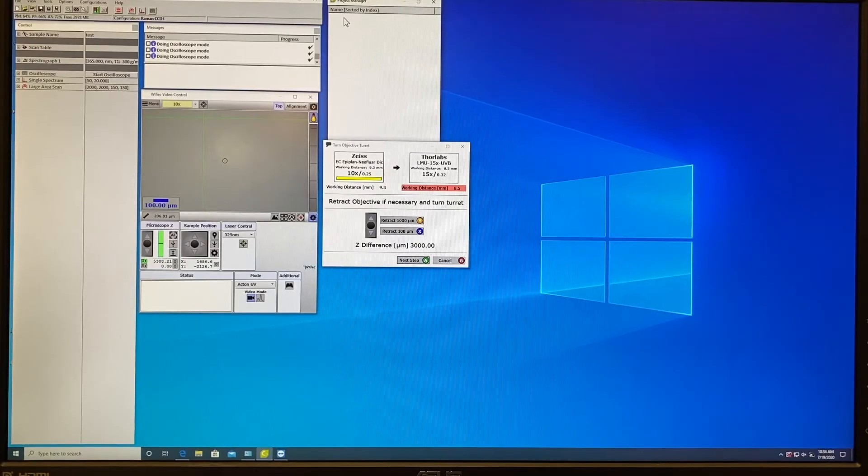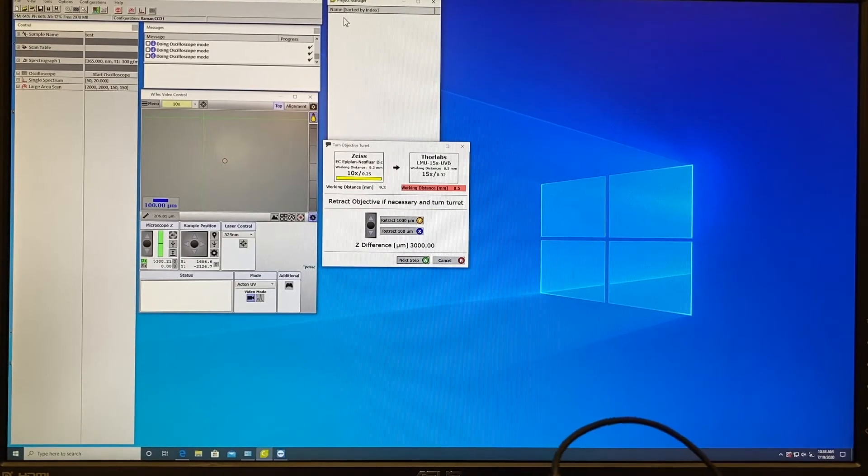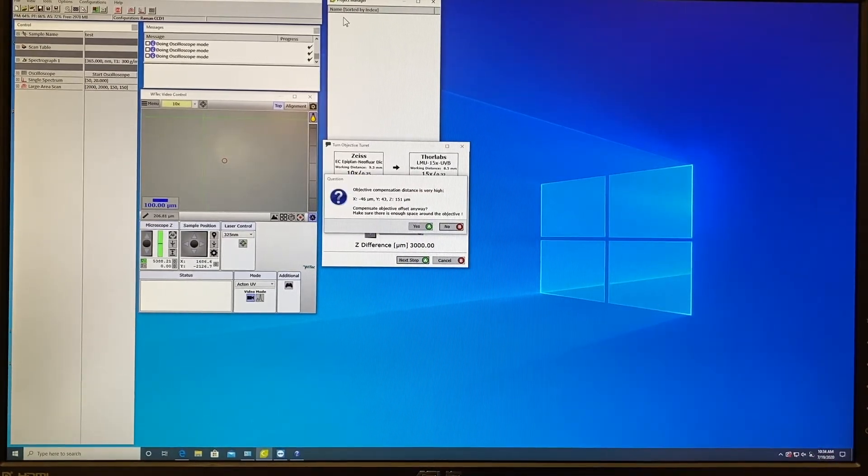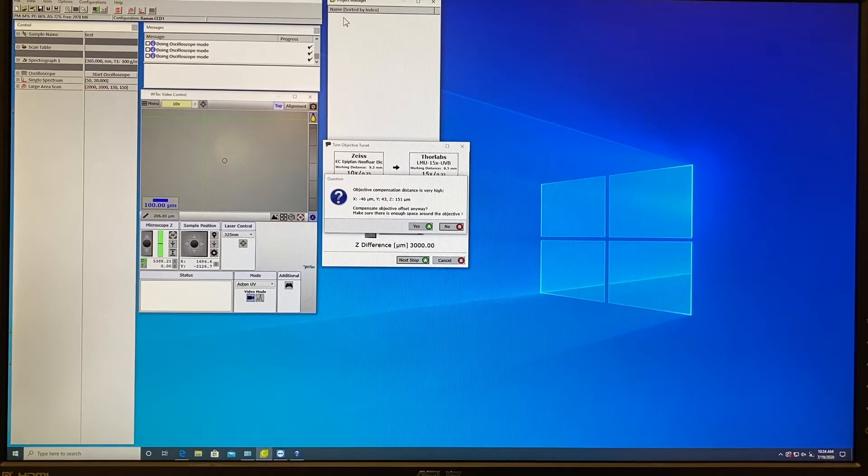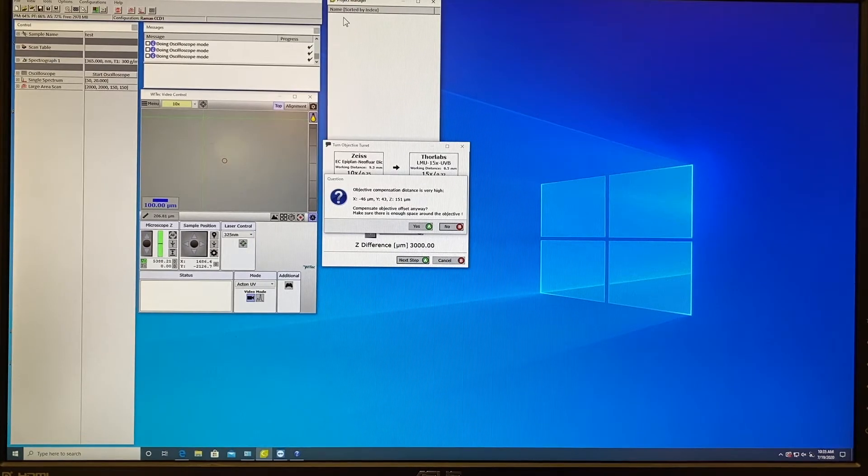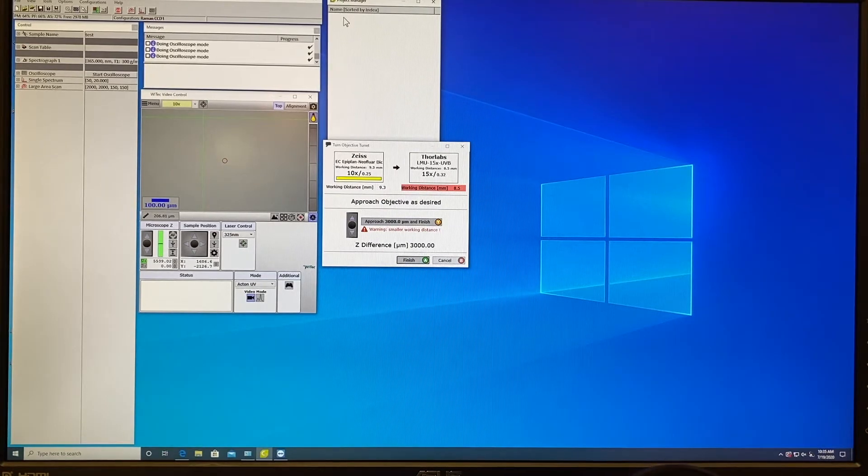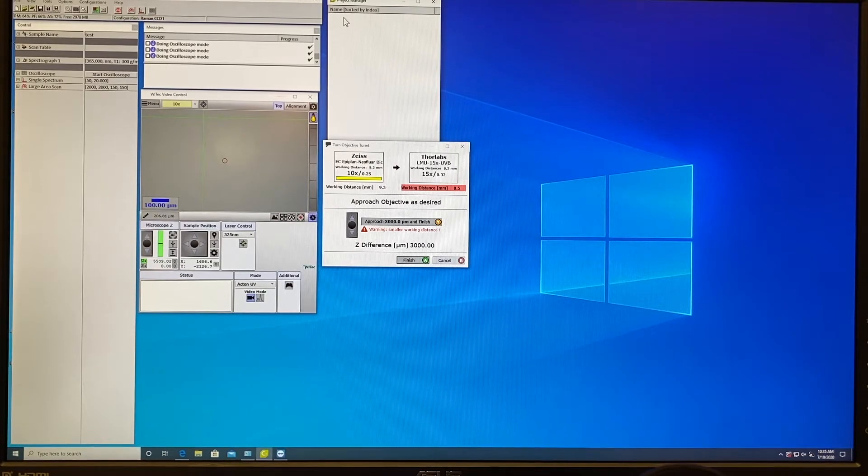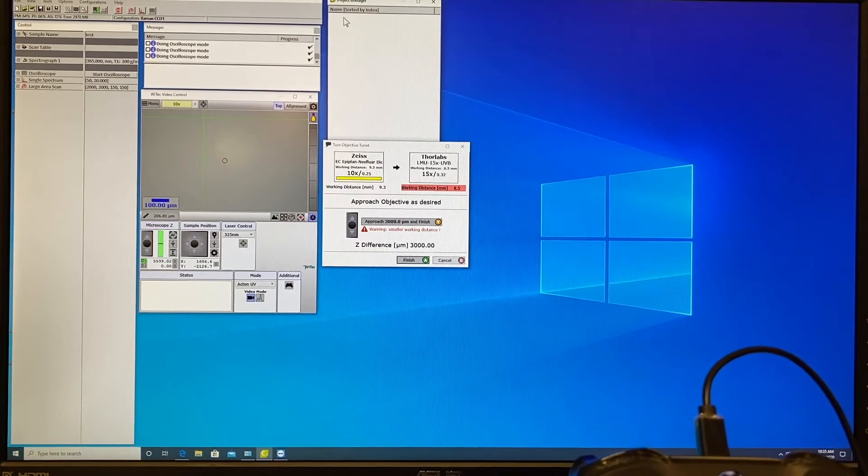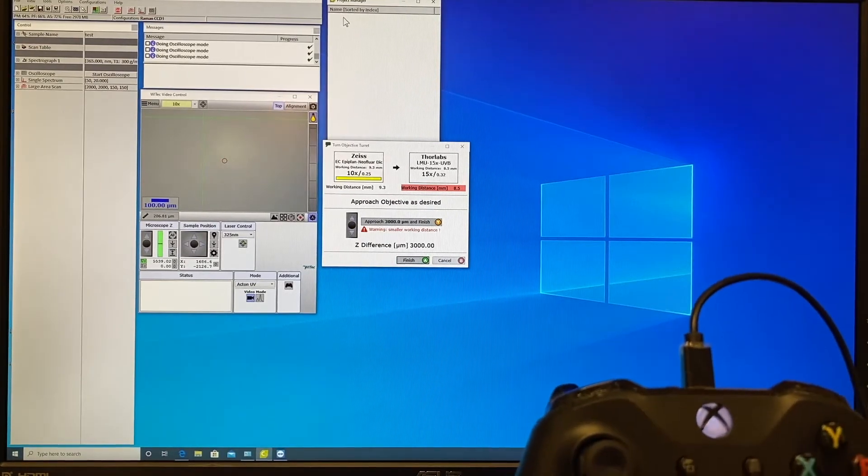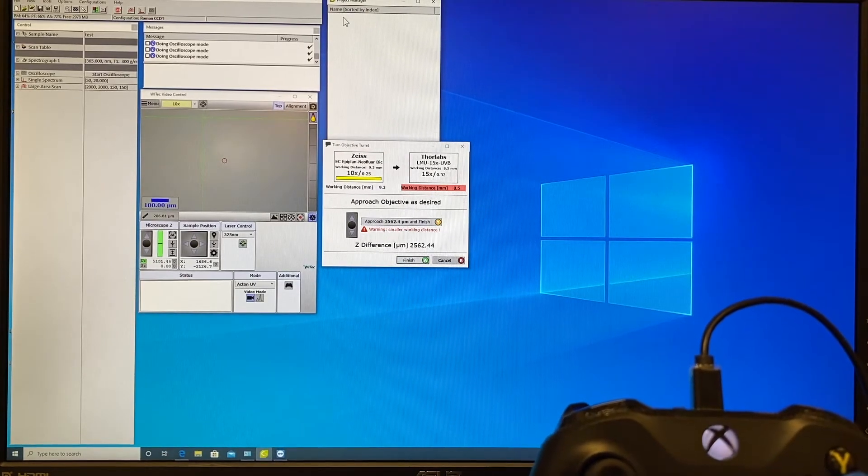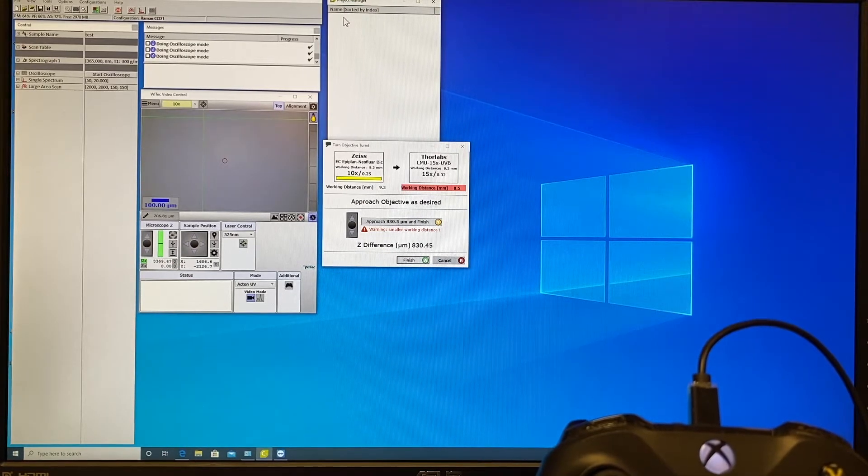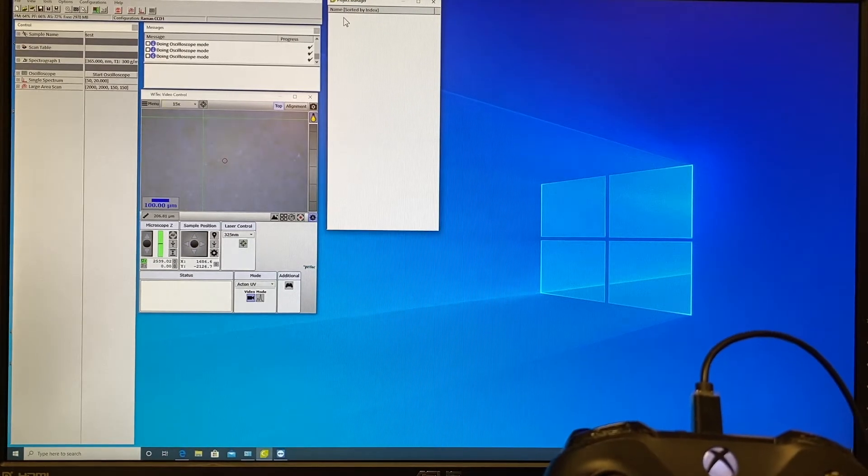Then you come back to the screen and press next step. You press A and then appears the message objective compensation distance is very high. If you selected correctly the objectives like from 10x to 15x you press yes. It proposes you to approach to the distance of 3000 micrometer and finish. You accept if everything is correctly done before. We accept with button Y and this will go back to our focusing distance so it will allow us to focus much faster on the surface.